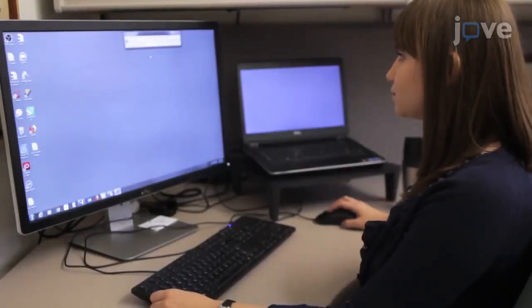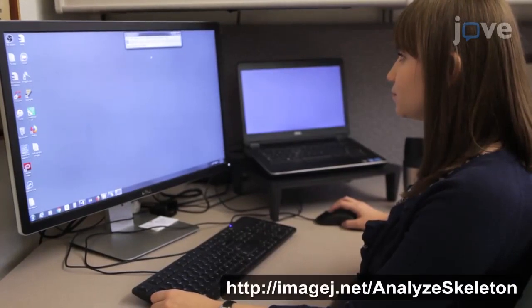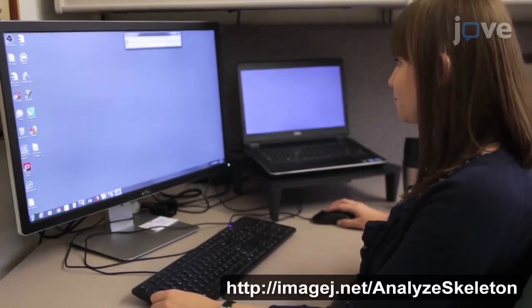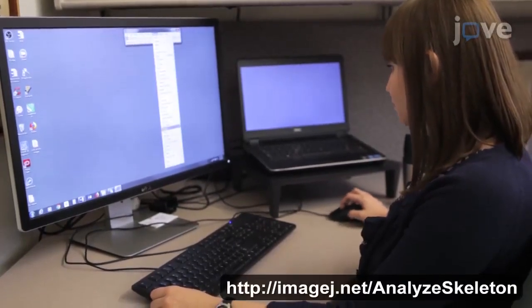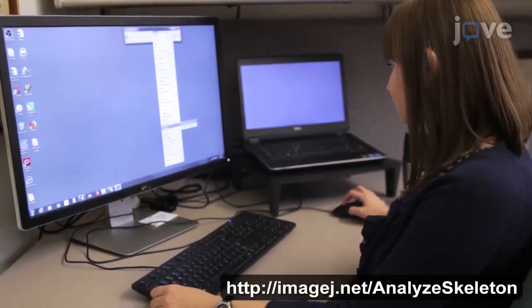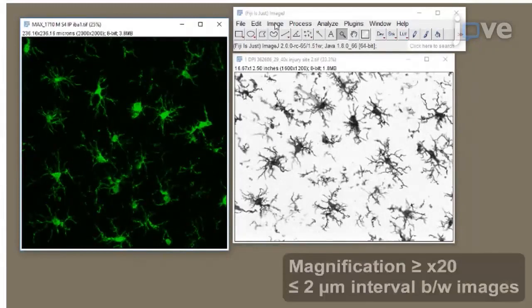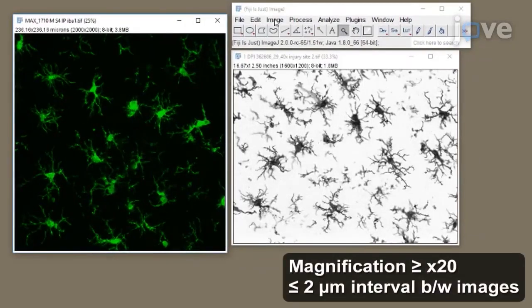Before beginning, ensure that the Analyze Skeleton plug-in has been downloaded to ImageJ or Fiji. Then, open a 30-micron Z-stack showing IBA1 immunostained brain.